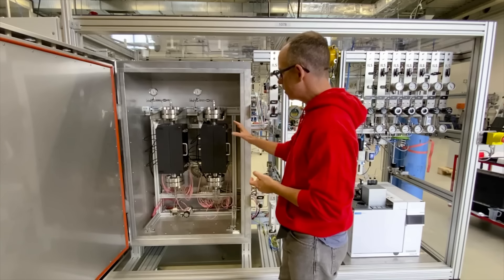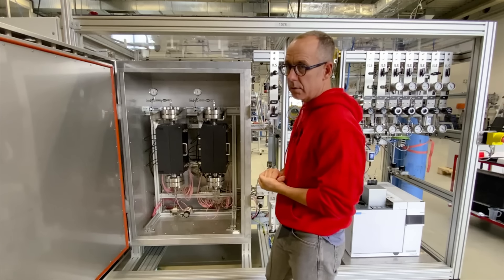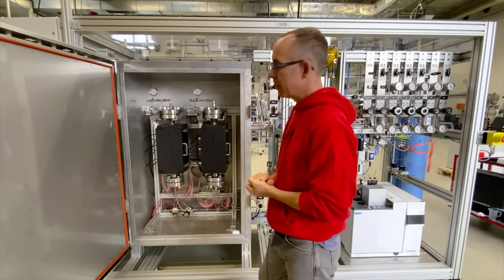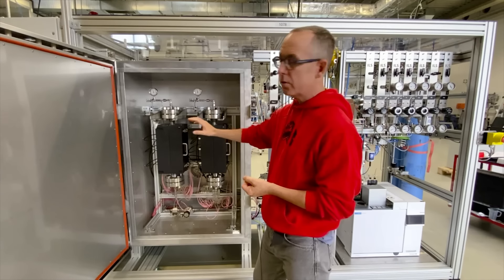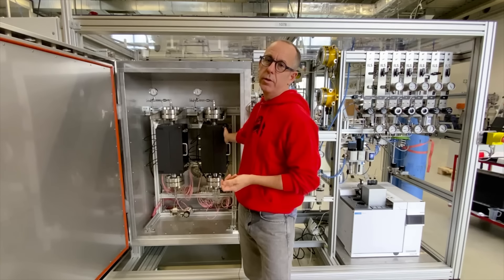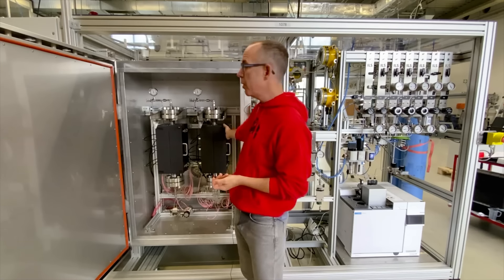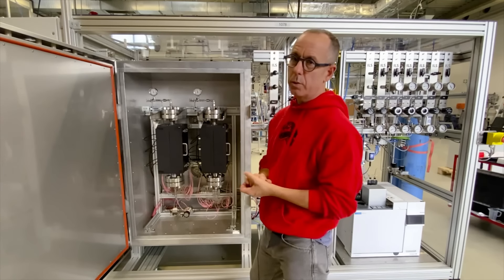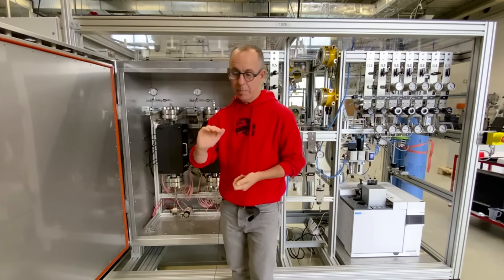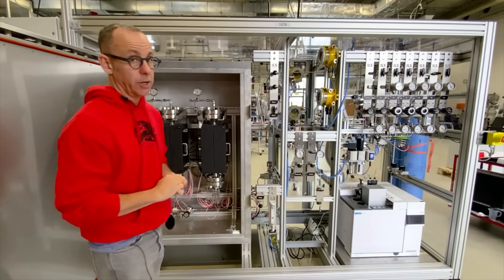The two reactors can be operated either in series or a single reactor can be operated by using them in series. You can, for example, do oxygen removal on the first reactor to remove ppm amounts of oxygen which can often be a poison for the ammonia catalyst to the second reactor, or you could operate, for example, two ammonia synthesis catalysts in series representing a multi-bed system with interstage cooling.